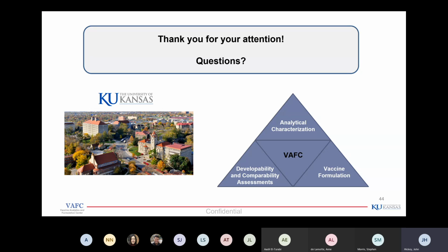Yeah, so I would say it's absolutely feasible. These days, mass spectrometry is fairly straightforward, especially with established systems, whether it be like Pichia or E. coli, where your HCPs are fairly well understood. As long as you have a decent idea of what's there, you should be able to identify them pretty easily and be relatively confident in your ability to quantify them.